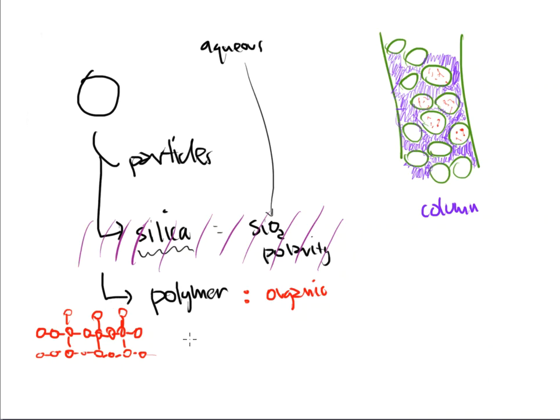The issue, though, is that very early on, the problem, and we've talked about this before, was how can we put aqueous samples onto a polymer, which is more organic and non-polar. And this was kind of hard to do in the beginning until they figured out how to modify the surface. As long as they modified the surface of this polymer, then we could inject aqueous samples on it without an issue. And those aqueous samples, because they were in water, is not going to cause us a problem. It's going to interact with the stationary phase particle, even though that particle is organic on the backbone.